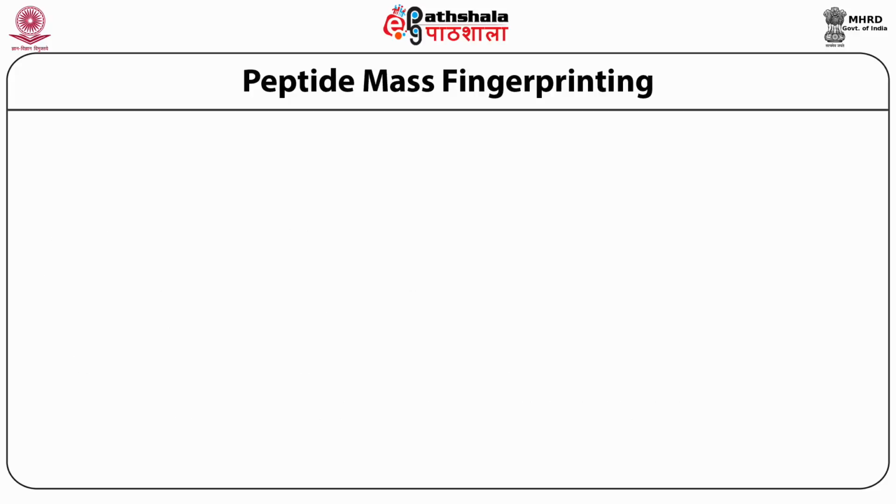Peptide mass fingerprinting, or PMF, has a principle similar to our fingerprints, which are generally specific to an individual person. The same thing applies in peptide mass fingerprinting.